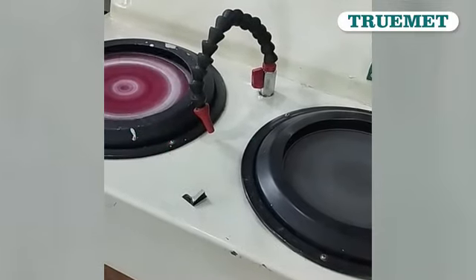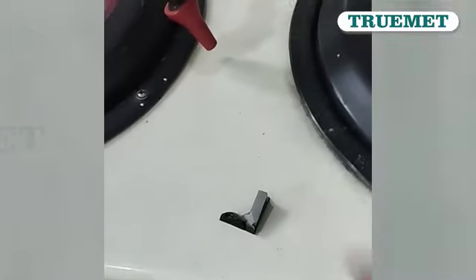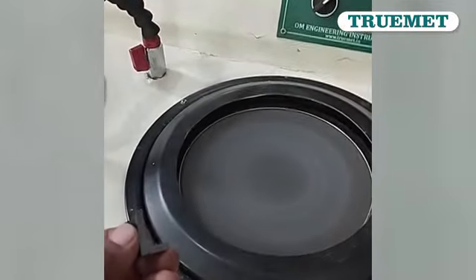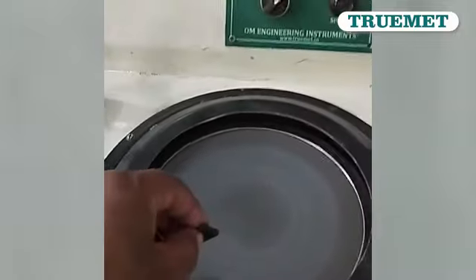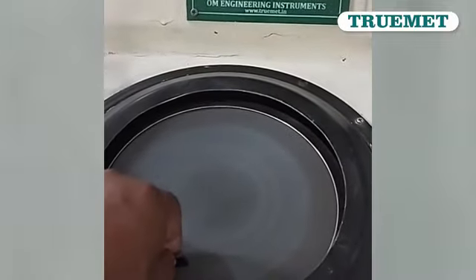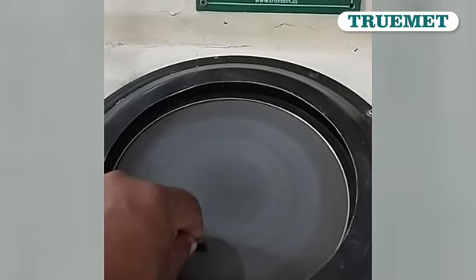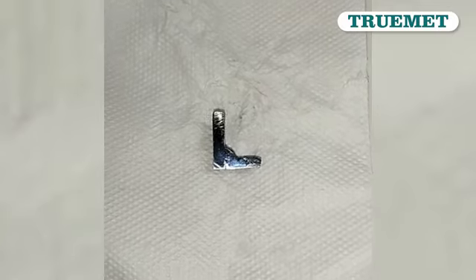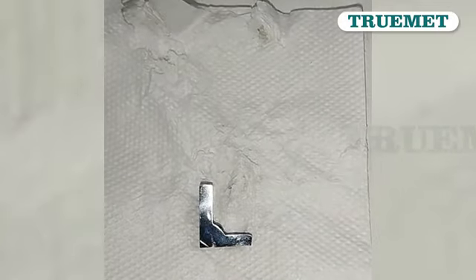After cutting the sample, we are moving to our second process, that is polishing of the component. We are going to polish this component on this machine. Firstly we are going to use emery paper, then polishing cloth. So polishing of the component has been done. You can see this is our final product after polishing.